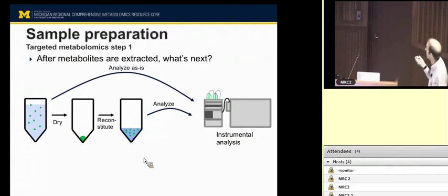Depending on your sample type, it can measure up to thousands of compounds. The identities, however, are not always as certain as what you get out of targeted, classically speaking. So some compounds in an untargeted data set produced by the Metabolomics core will have confident identities. You'll have a list of species with quantitative values that you can look at, and you'll know what these things are. But some compounds out of an untargeted data set may not be identified at the outset.